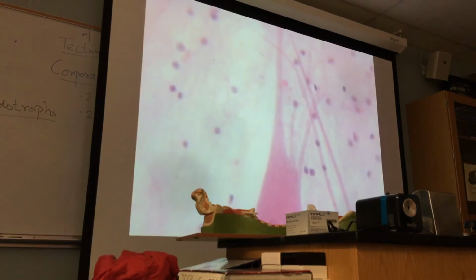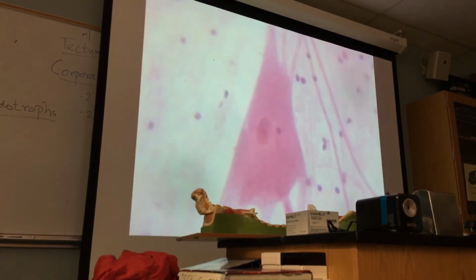So, all the structures of a neuron covered. So how many structures? The dendrite, number 1. Cell body, number 2. Axon hillock, number 3. Initial segment of the axon, number 4. Only axon, number 5. Axon collateral, number 6.